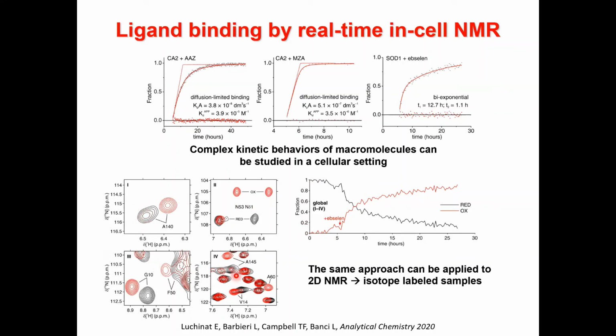These are the pure components retrieved by the MCR-ALS algorithm. And then this is just a simple bi-exponential fitting that has no biological meaning. It's just to show that one can fit the data if you know the model or if you make hypotheses. So this approach is quite robust and versatile, and can be applied to 1D NMR, to 2D NMR, and in principle to higher dimensionality. It would increase the computational requirements a little bit, however. And it's very useful to then study kinetics in cells.